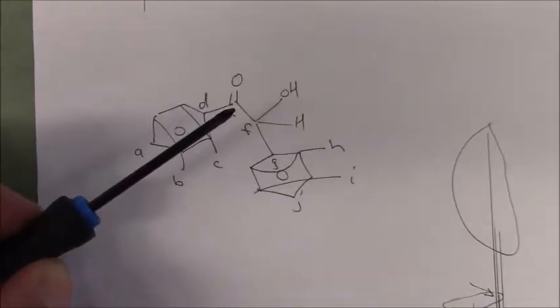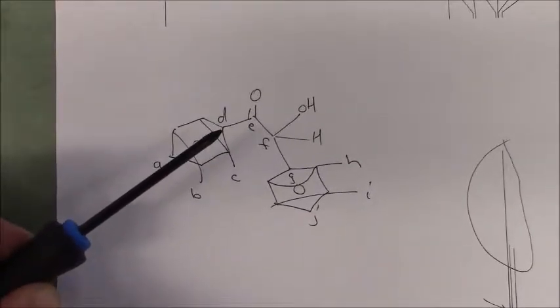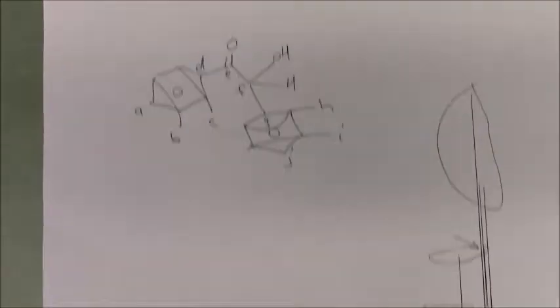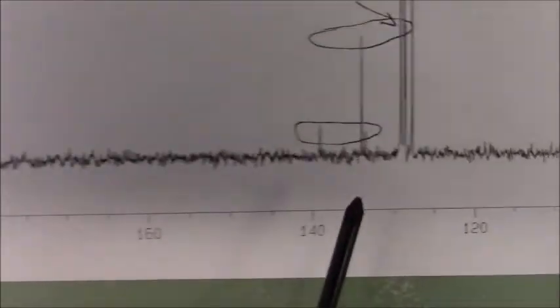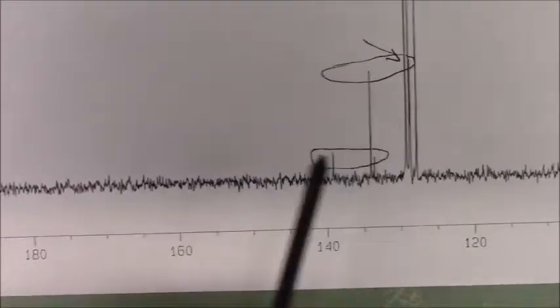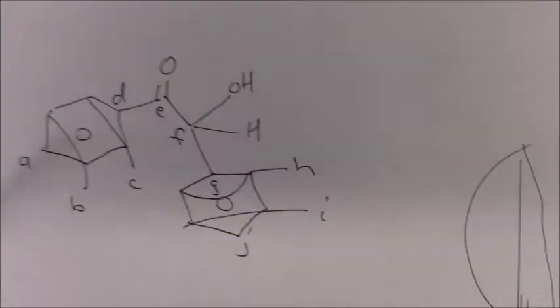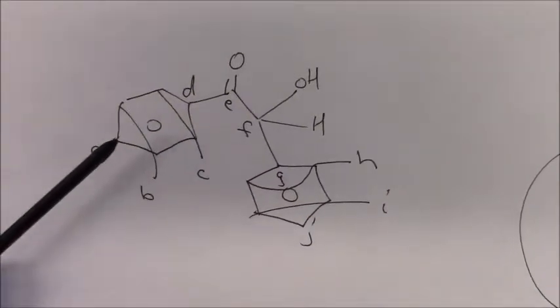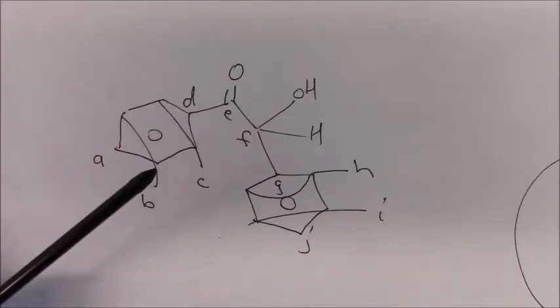And we notice that carbons that have no hydrogens on them, quaternary carbons, are the shortest. So it stands to reason that D and G with no hydrogens on them should be 2 small ones. So notice how that's very short, and see how here I've circled these 2 short ones. So circle that, and you could say they are D/G. What's left is any of the carbons like A and J. See how there's only one? When you have something like B, there's 2 of them, so you get twice the height.